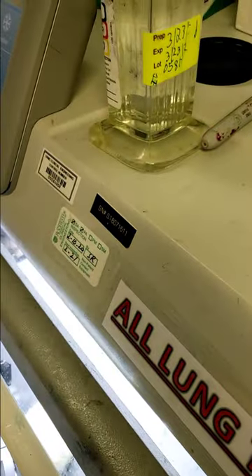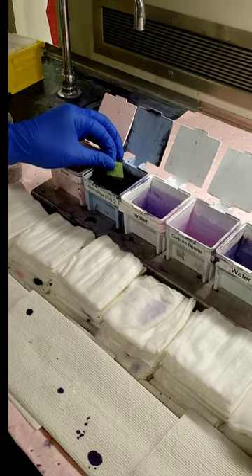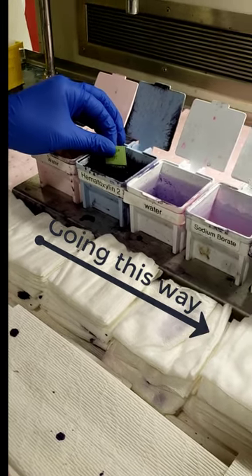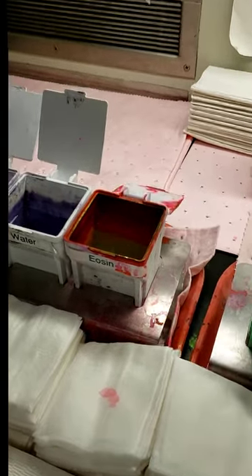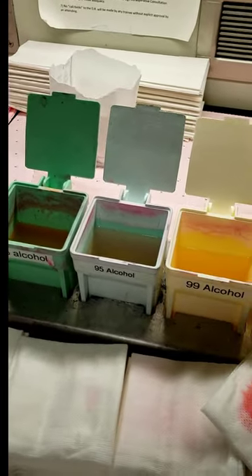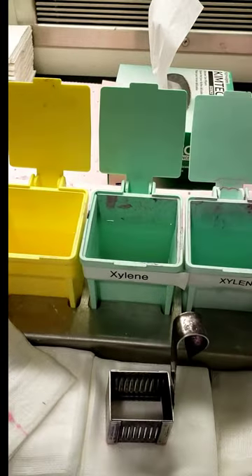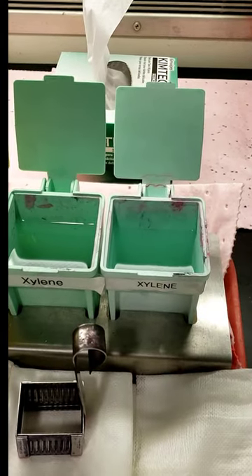The slide is going to be put into alcohol. Because we're trying to do this rapidly — less than 20 minutes is our requirement — we have this fabulous staining line. The slide goes from water to hematoxylin, back to water, to sodium borate to blue it up, back to water to rinse, then to eosin. Then 95% alcohol for a couple dips, another 95% alcohol bath, then 99% alcohol, and then xylene, which helps clear the slide. And then a final xylene bath.